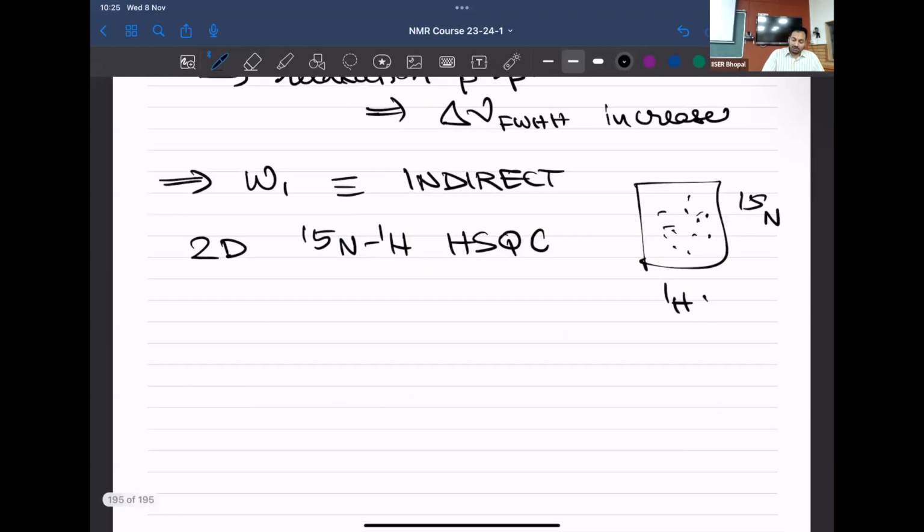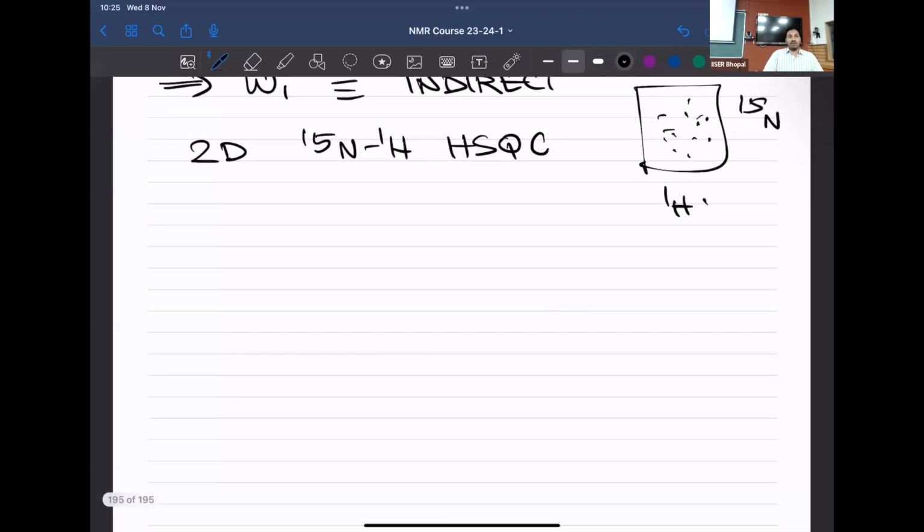So I hope you guys all accept the fact that a two-dimensional NMR experiment is therefore imperative for us to characterize larger systems. But at the same time, as I said, 2D NMR is important. Slowly, we will also understand 2D will not be sufficient in the cases where the proton and the nitrogen, for instance, have an overlap. As much as you're able to envision, as the size increases, proton resonances start to overlap because there are too many.